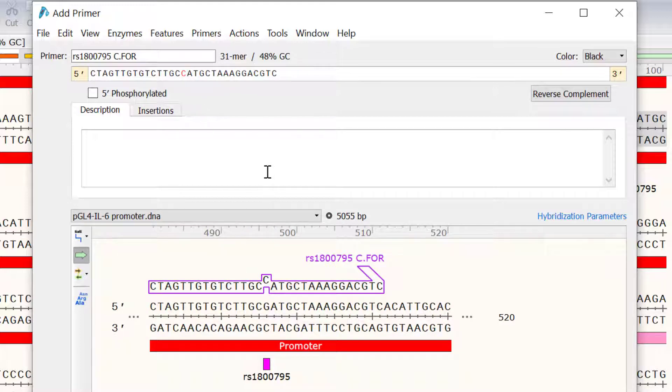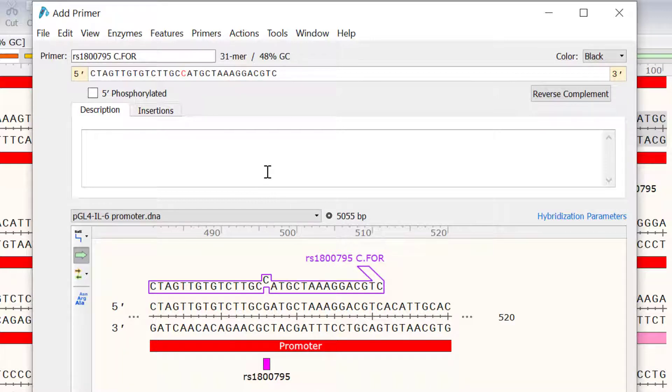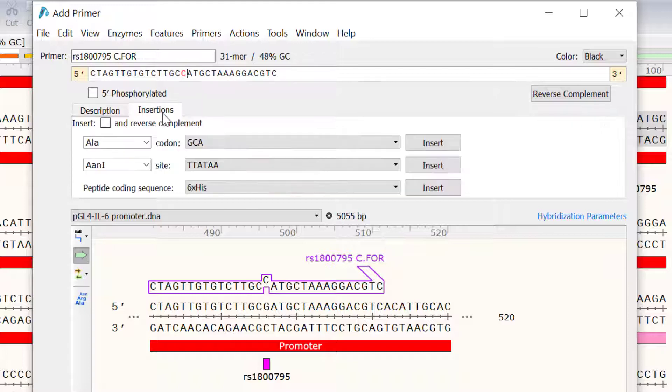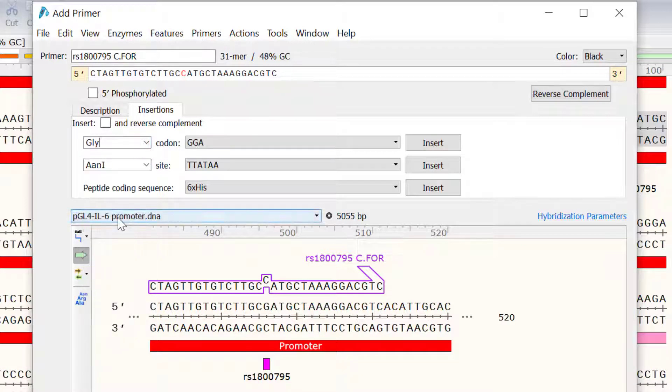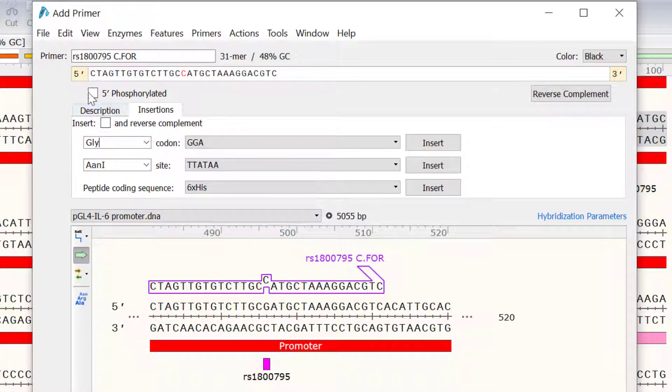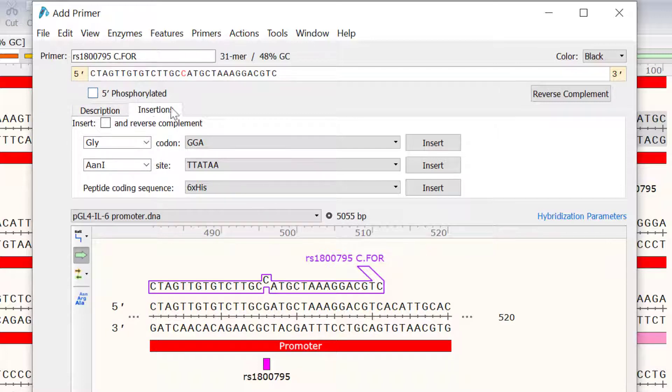As well as changing bases in primers, you can also insert codons to primers. I will quickly explain how this is done. Switch to the Insertions tab and select a desired codon from the drop-down menu. Then either click a position if you want to insert the codon, or select a region if you want to swap the codon, and click Insert.